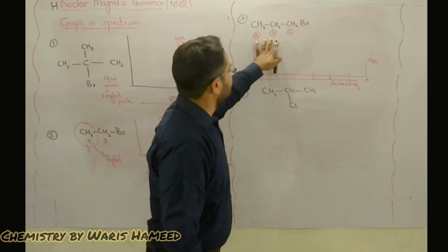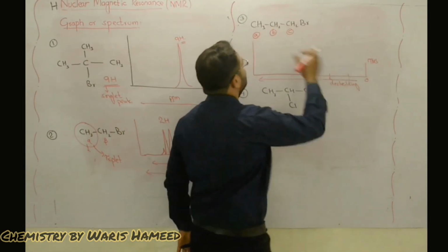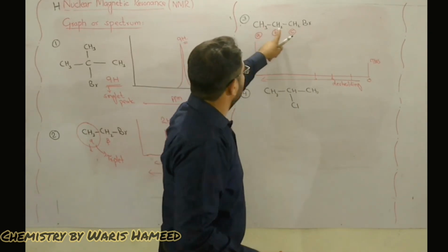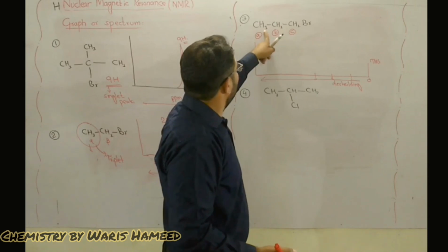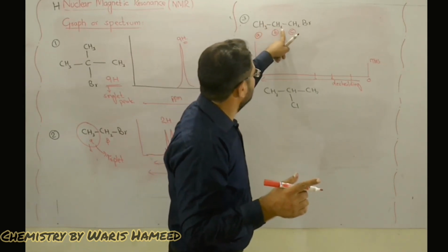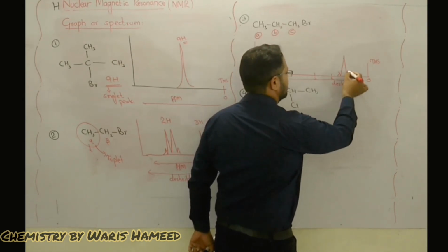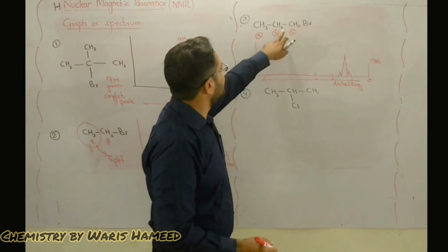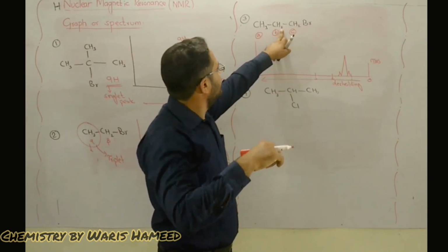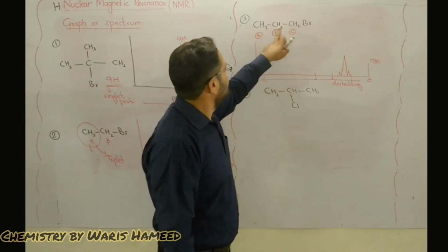So their orientation will be as follows: first this proton will be mentioned over here, and what type of peak will it be? 1 plus 2, so the peak for A proton will be a triplet. And for the second proton, first one is itself and there are 5 neighboring protons, 3 and 2.